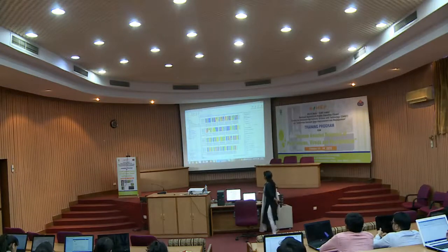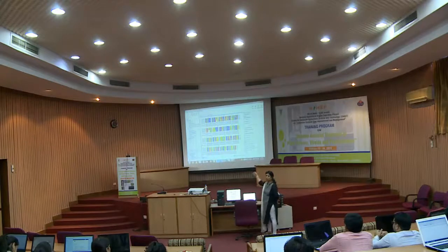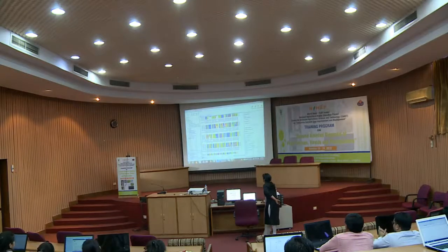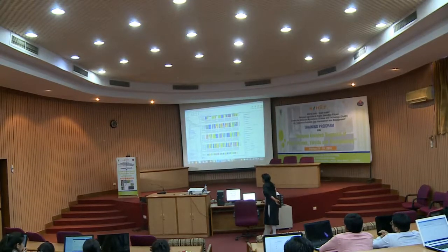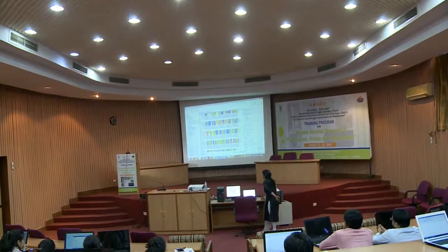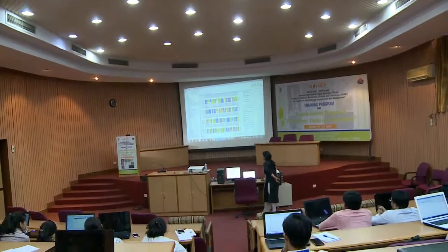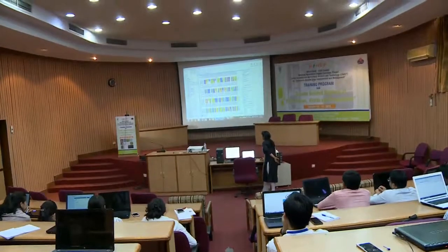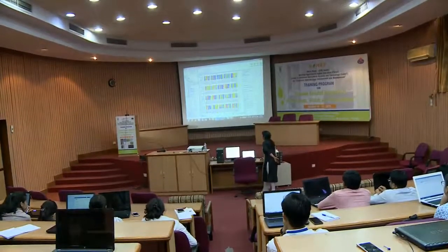So, these are my sequence variations only, these are not errors, correct. I showed you these samples because here you can see the variability and the deletion also. Then for this variability, in some it is T, in another it is A. If you go further up, here it is G, A, these 2 bases are inserted over here, the base insertion is there, here also an insertion of a stretch, here also an insertion of a stretch, right.